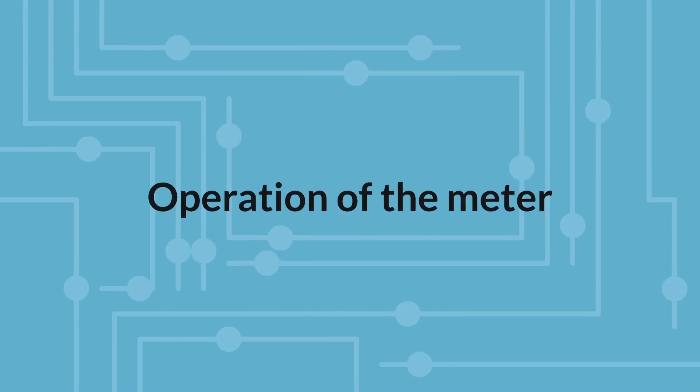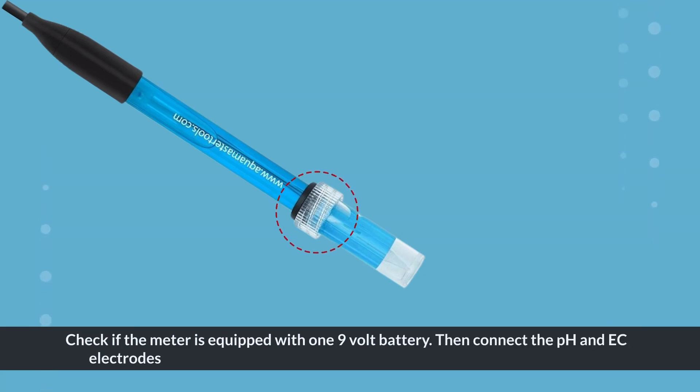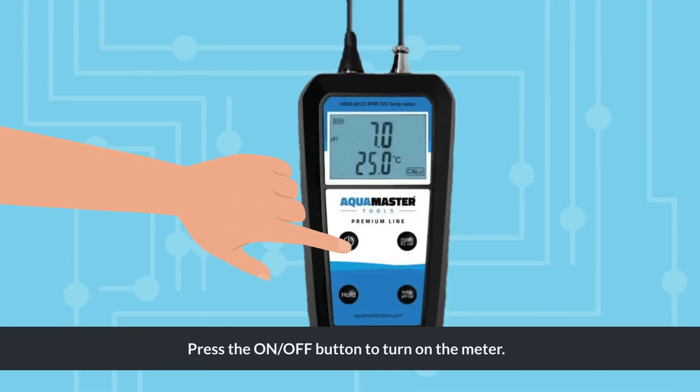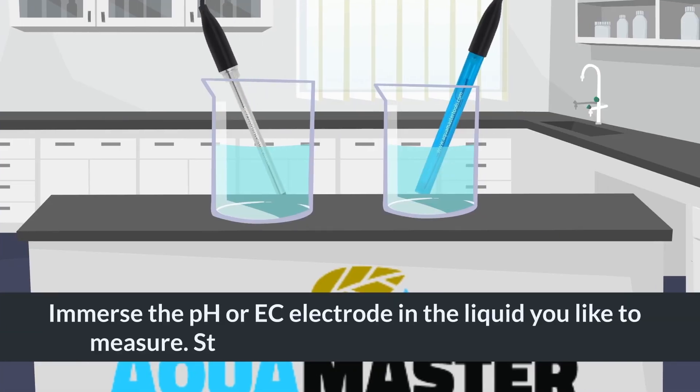To operate the meter, first check if the meter is equipped with one 9-volt battery. Then connect the pH and EC electrodes to the instrument and remove the protective caps of the electrodes. Press the on/off button to turn on the meter, then immerse the pH or EC electrode in the liquid you would like to measure.